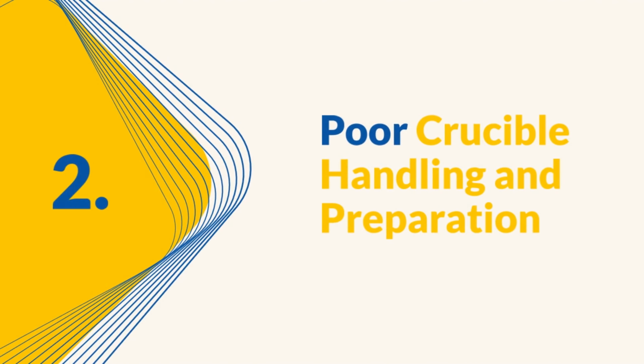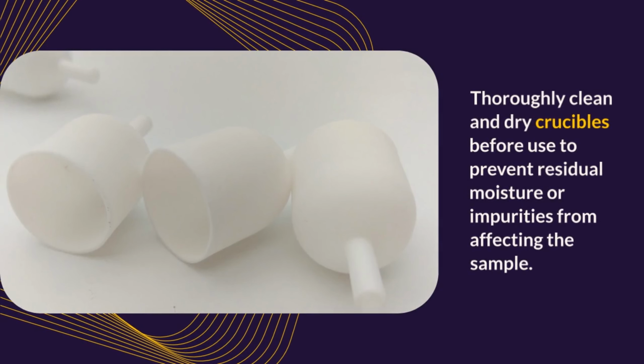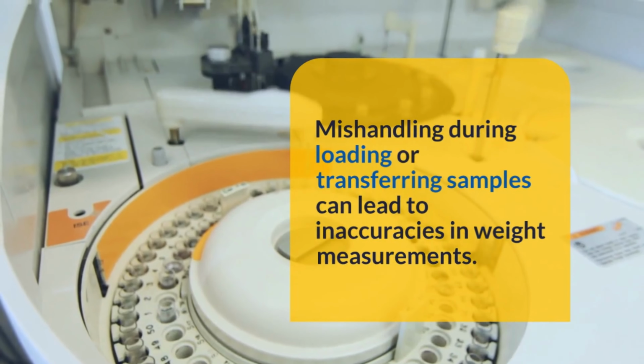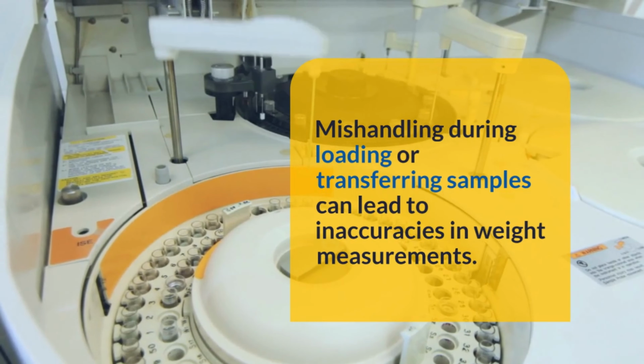Improper handling and preparation of crucibles can introduce contaminants or inconsistencies in your analysis. Crucibles should be thoroughly cleaned and dried before use to prevent any residual moisture or impurities from affecting the sample's behavior. Mishandling crucibles during loading or transferring samples can also lead to inaccuracies in weight measurements.